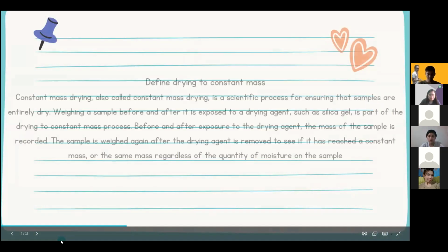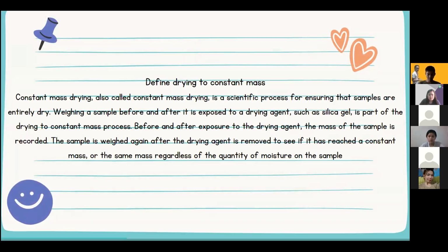Before we proceed, we have a procedure, preparation of crucibles. I'm just going to read it since we did not put it on the slide. Number one is to clean the crucible to be used thoroughly by backwashing on a filtration train. Backwashing a filtering crucible is done by turning the crucible upside down in the adapter and sucking water through the inverted crucible. Number two is to dry the crucible to constant mass.